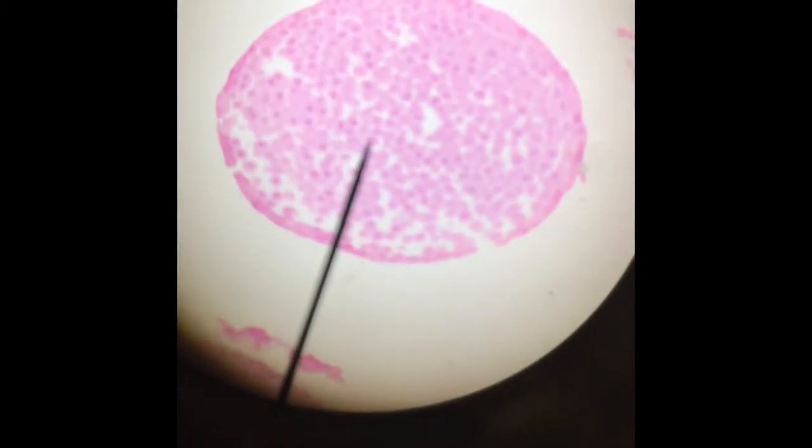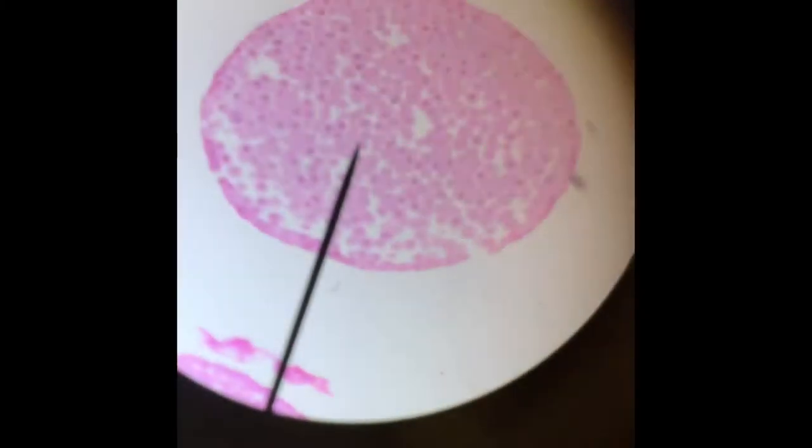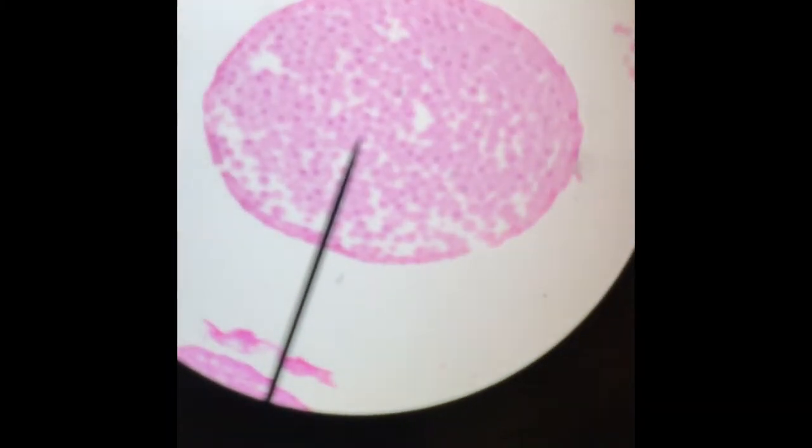Okay, look at that. So that's low power. So that giant pink circle is a cluster of a ton of different individual cells in there. I don't know if you can tell, but there's little white spaces in between. There's probably a couple of hundred cells in that one field of view.